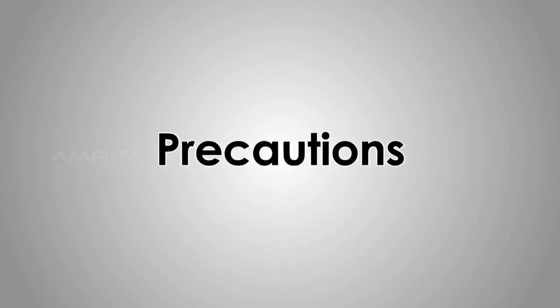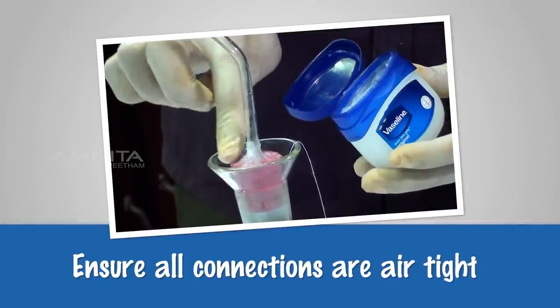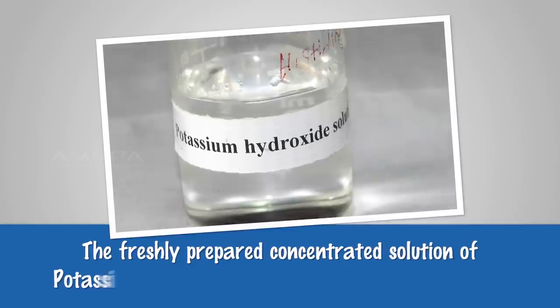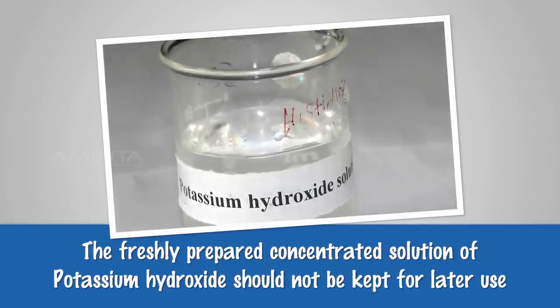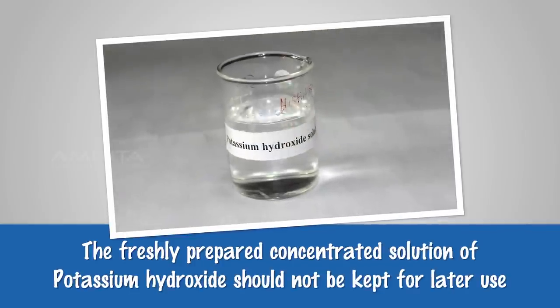Precautions: Ensure all connections are air tight. The freshly prepared concentrated solution of potassium hydroxide solution should not be kept for later use.